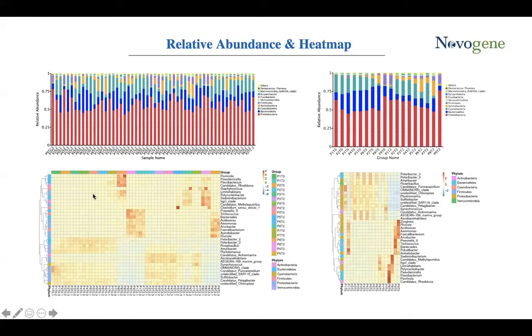It is plotted with the sample name on the x-axis, and the y-axis represents the genus. The absolute value of z here represents the distance between the raw score and the mean, in units of standard deviation. So in this map, the redder the color, the more this genus is clustered in this sample, and vice versa.